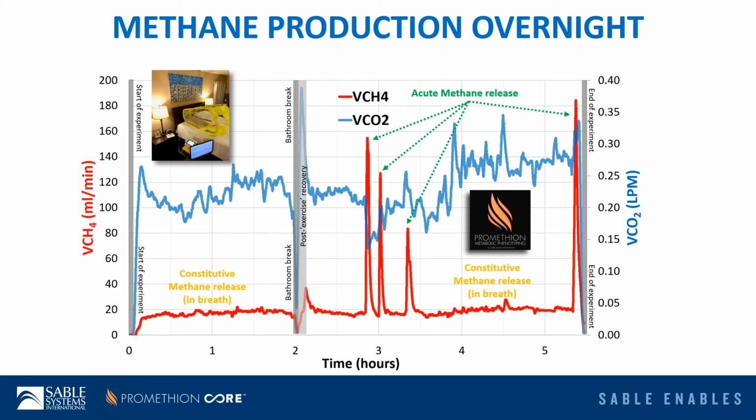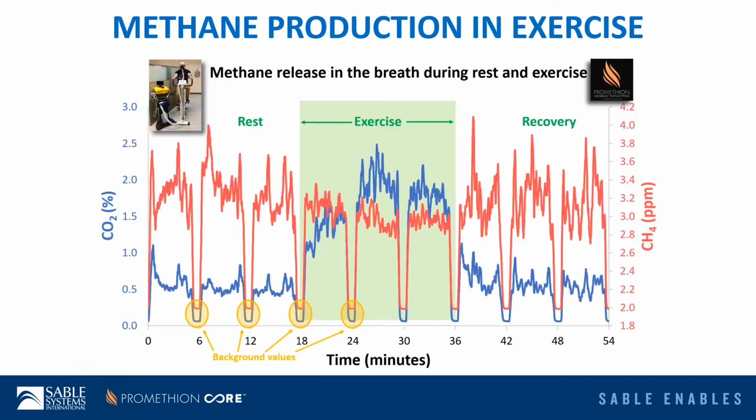I hope you'd agree with me also that the majority of methane is actually leaving my body not in the flatus, but rather in my breath, constitutively. So if we want to eliminate discrete methane release events and focus on the majority of that methane release that occurs in the breath, all we have to do is use a mask. So here's one of our research scientists wearing a mask during a 1-hour measurement, and air was pulled through the mask at a constant rate of 50 liters per minute.